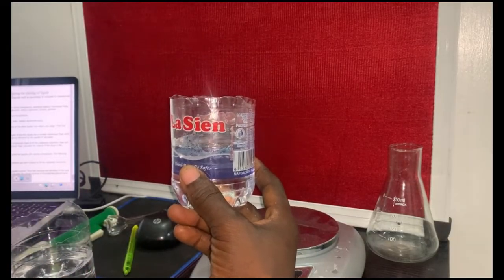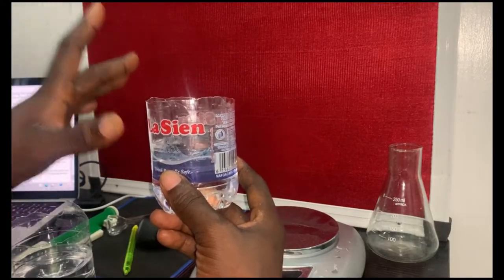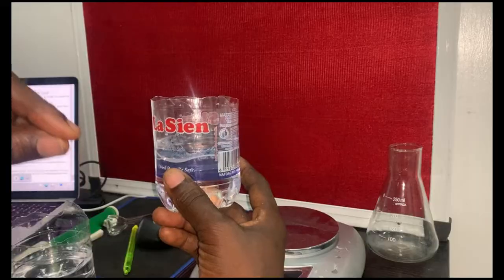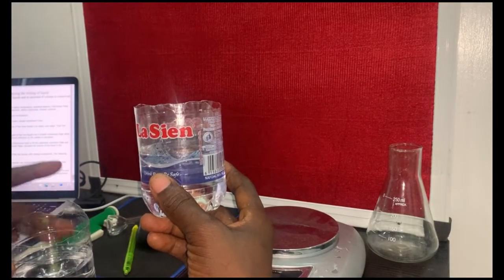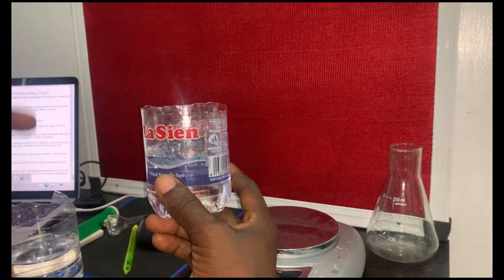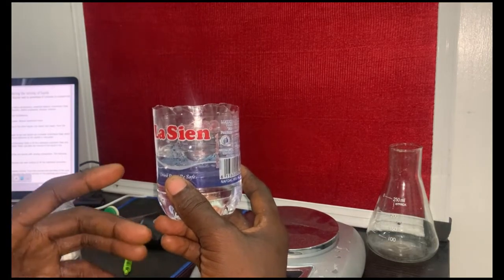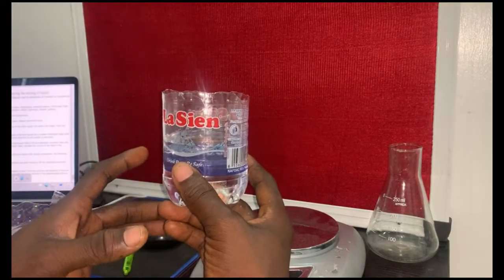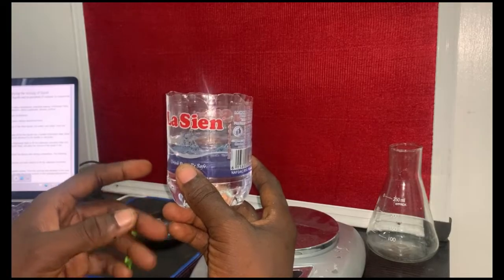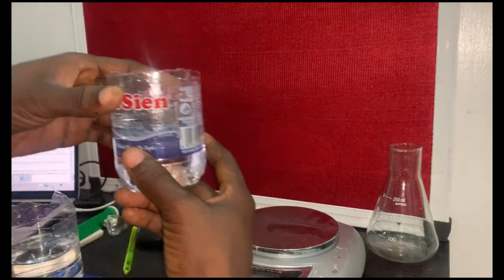Please let me state this. In the lab, this second liquid can vary. They can actually give you guys acetone. It's not compulsory that you're going to make use of ethanol. If you go through your manual, you realize that they said distilled water and any other liquid such as ethanol, acetone, isopropanol. So when you get to the lab and you see acetone, you're not supposed to be confused. The purpose of this experiment is to make you understand how to carry out this experiment.